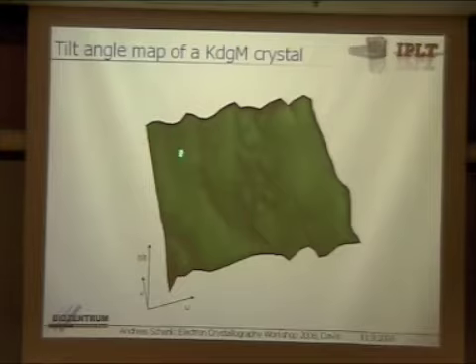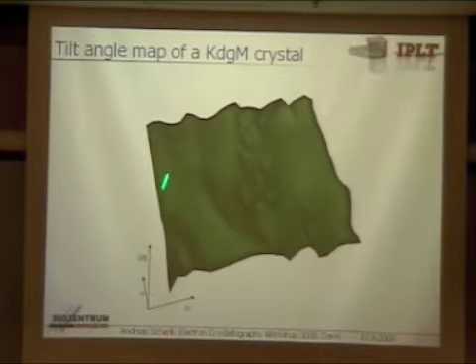But it's just funny that this tilt is in kind of ripples. I think probably here the crystal is not flat. There might be additional effects. I mean, you also see here these weird holes and things. There might be some defects which then give these weird tilt angles. But for sure, the crystal was not flat.